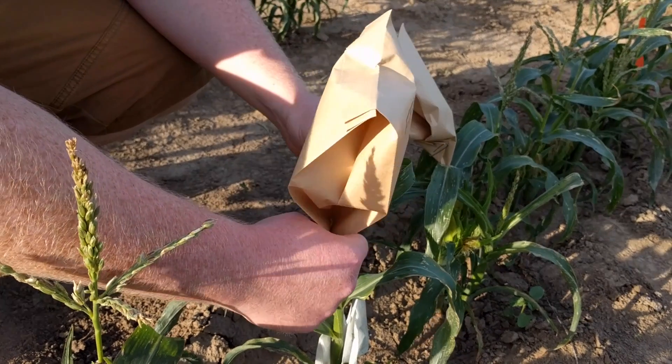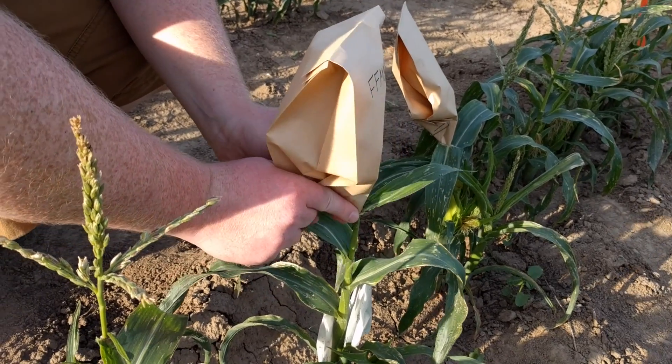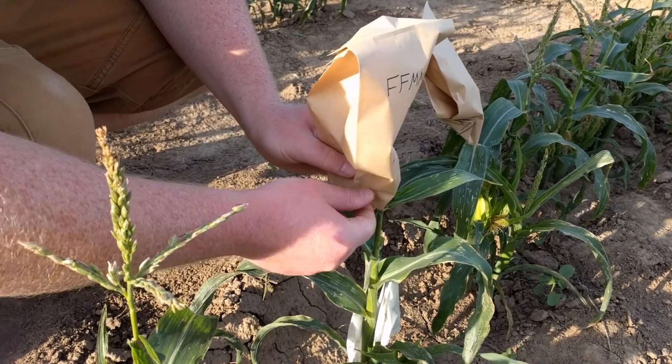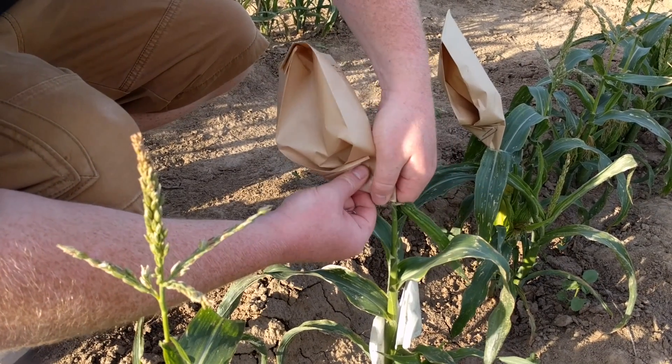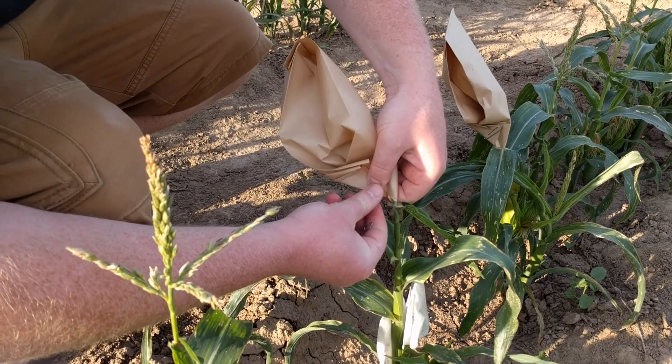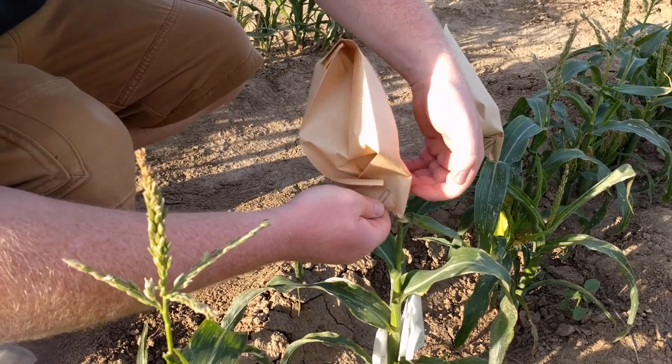Place the bag over the tassel and bring the open end together roughly centered on the base of the tassel stalk. Fold the opening end of the bag in half around the tassel stalk so that the corners of the bag meet. Fold the corners up at a 45-degree angle to seal the bottom of the bag. Apply a non-skid paper clip to hold this fold and keep the bag securely on the plant.